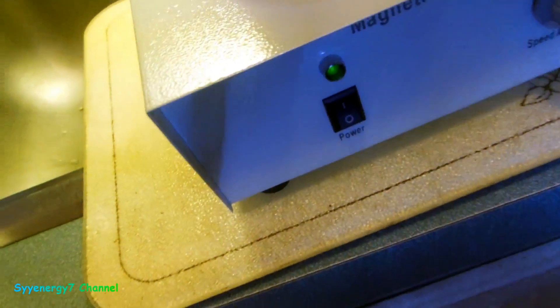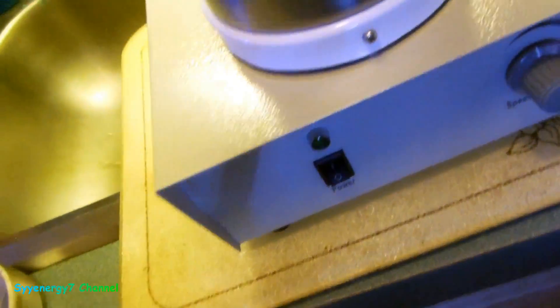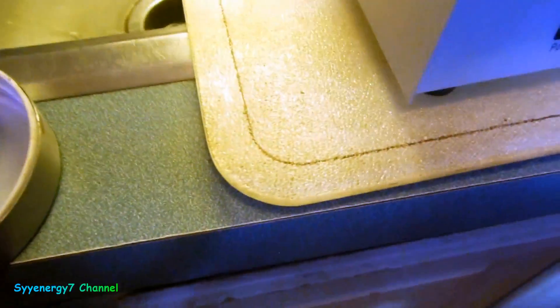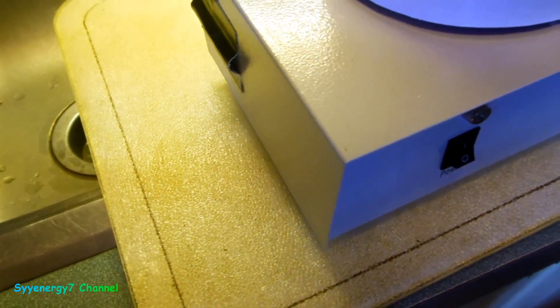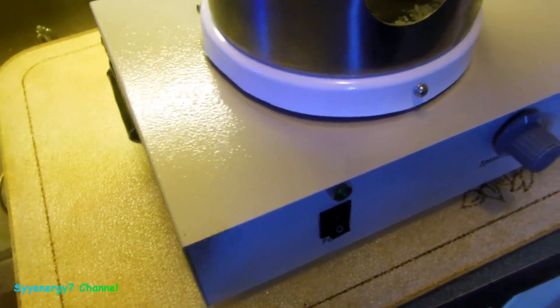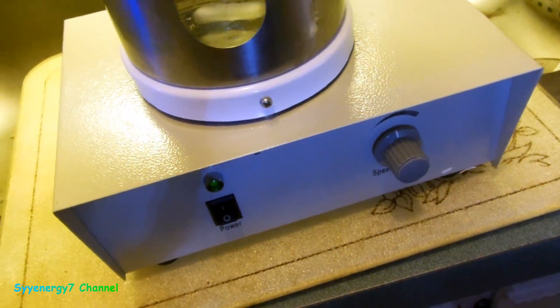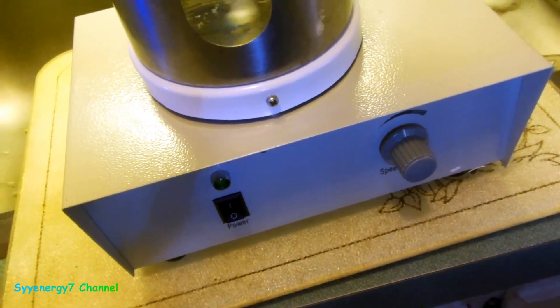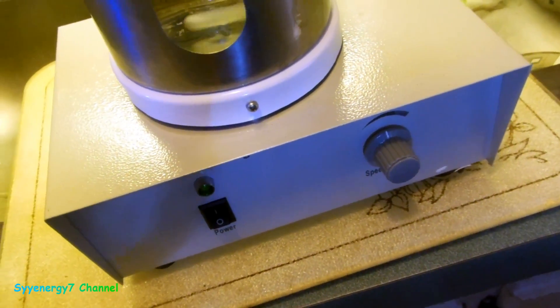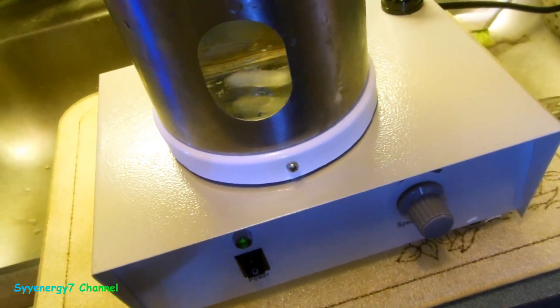So that's all it is - just a switch, on-off switch, speed control, and it comes with an extra fuse which I taped to the side here in case I blow the fuse. I got an extra fuse. Well worth it. I mean, I guess if you were going to make one of these unless you had the spare parts, it would still take you a couple hours or more to make. You're probably better off buying it and then you got something that works like properly. And if it ever breaks, I'll take it apart and fix it, you know, that's the thing.